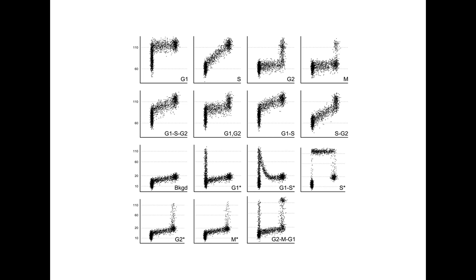These are synthesized patterns based on ideas, but we and others have observed most of these patterns when looking at specific markers. In many cases, the compartments derived from these patterns are not unambiguous. For example, mitotic markers show elevated expression and mark mitotic cells, but the pattern contains cells that are entering and exiting mitosis within the same data space, i.e. the compartment is ambiguous. To render these ambiguous compartments unambiguous, we need additional markers.